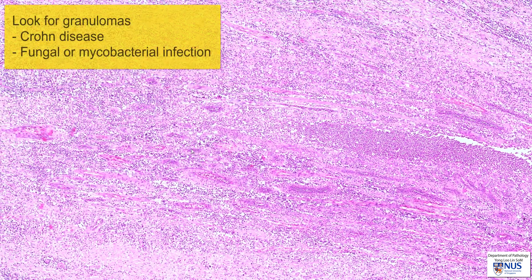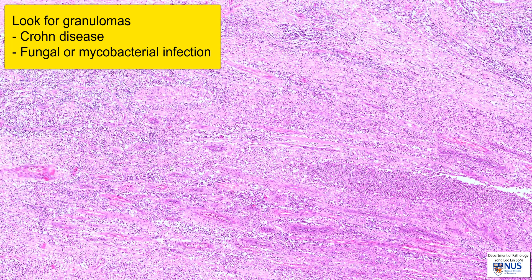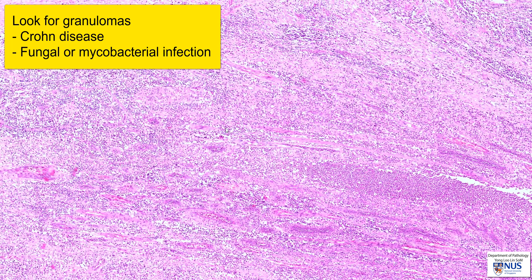In examining fistulae, we should also look for epithelioid granulomas, which could mean that this patient potentially may have inflammatory bowel disease, such as Crohn's disease, which predisposes to anal fistulae, or an infectious process, for example, TB or a fungal infection.